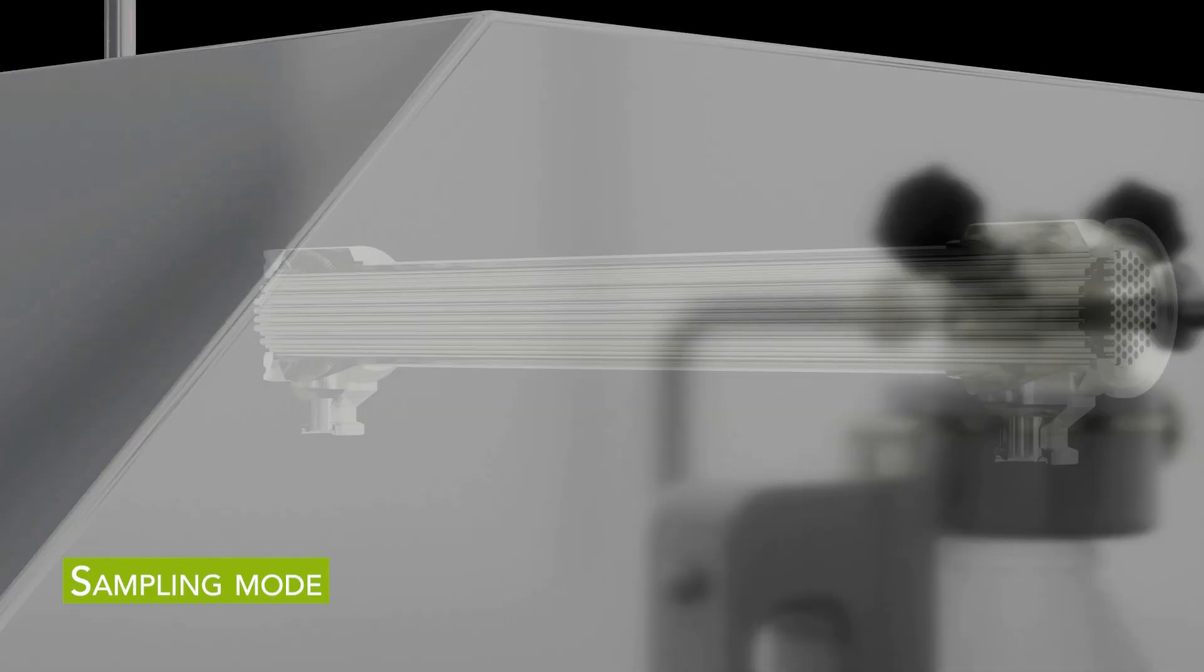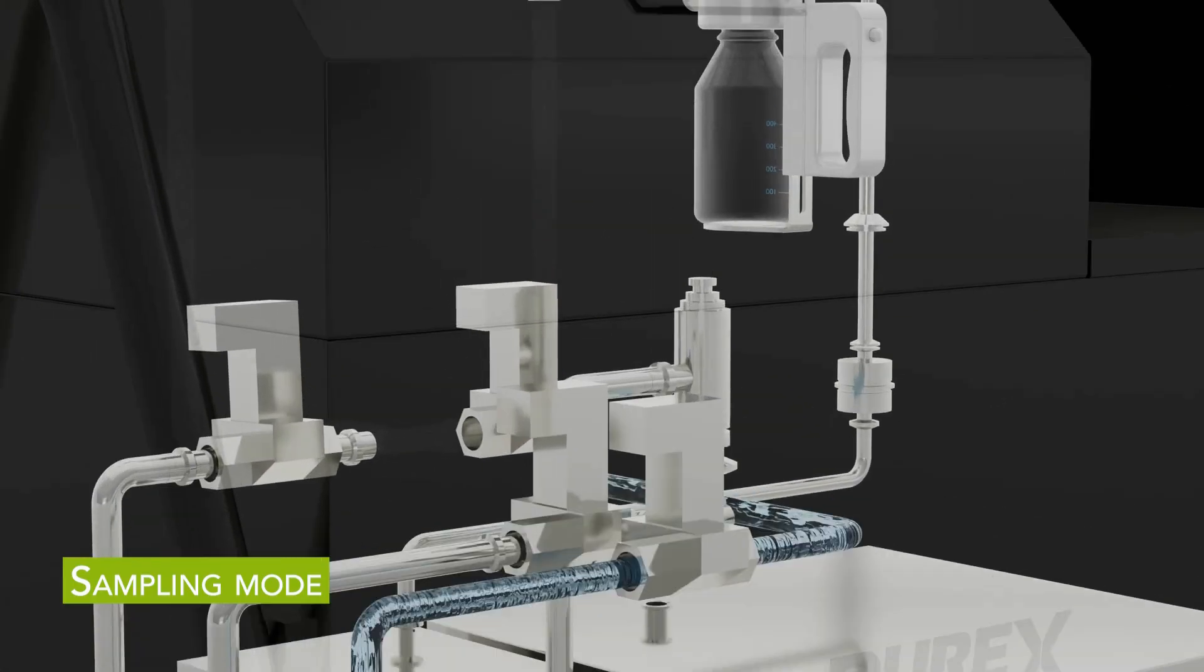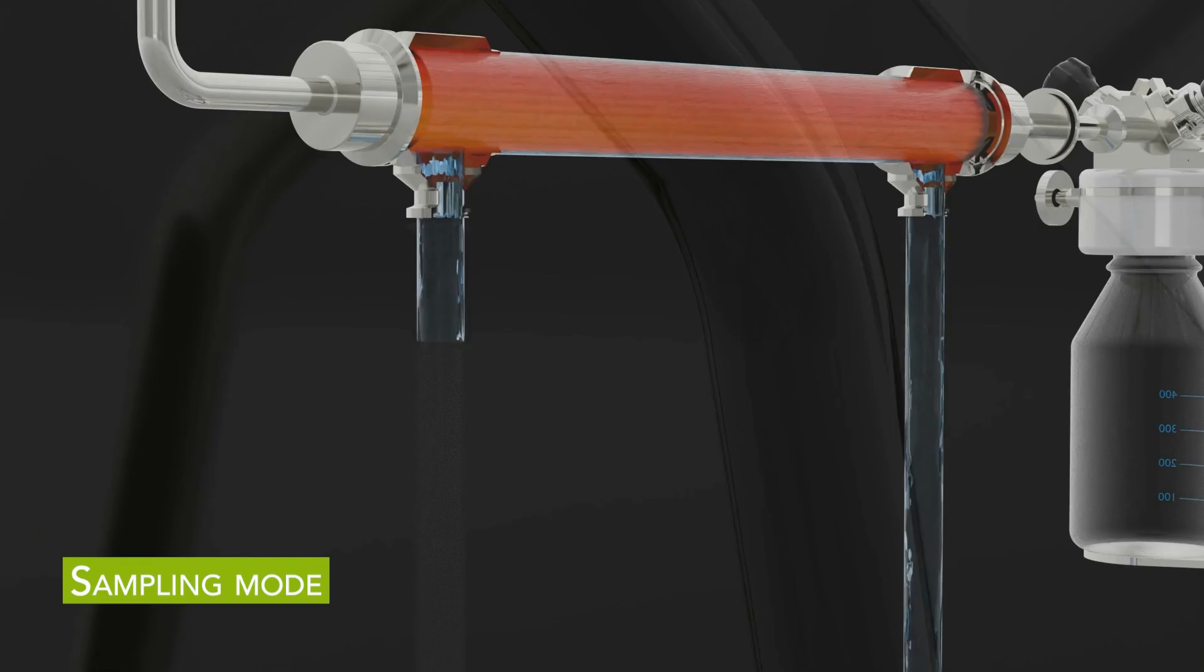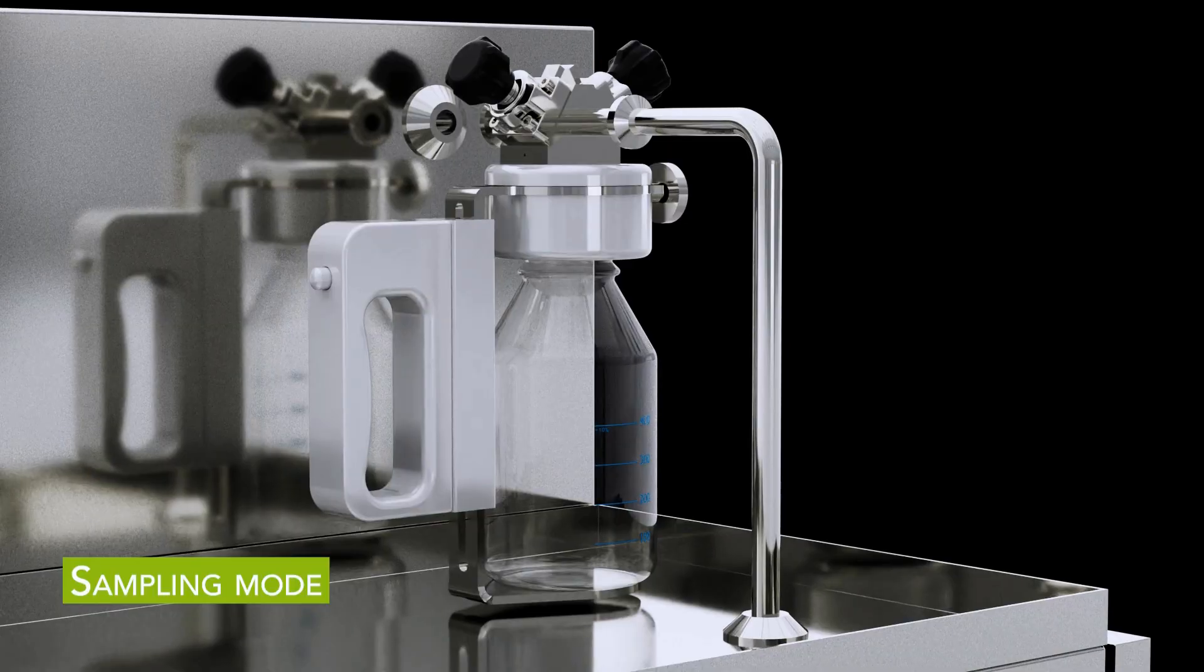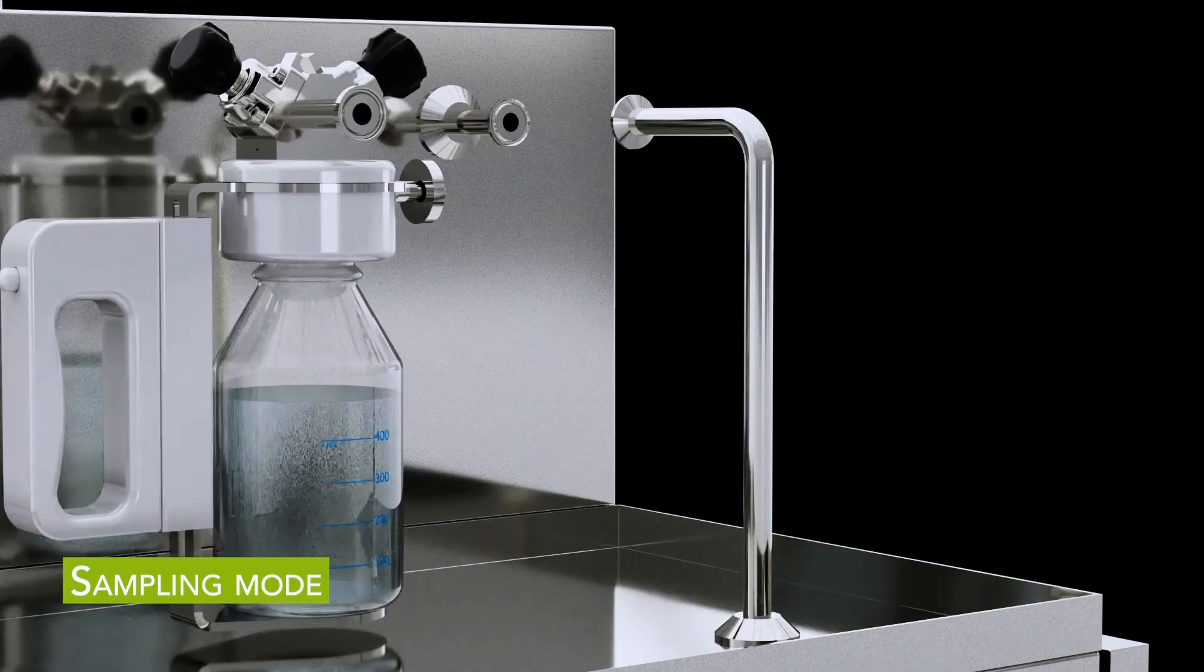During sampling mode, cooling water is automatically circulated through the heat exchanger shell, allowing steam condensate to be safely and efficiently collected in the sampling bottle.